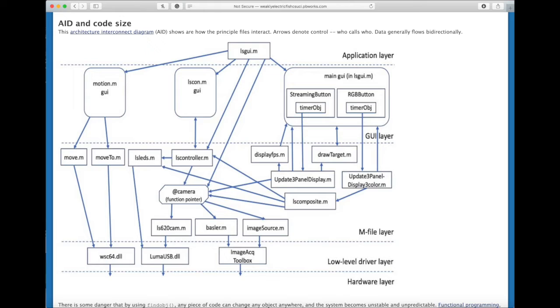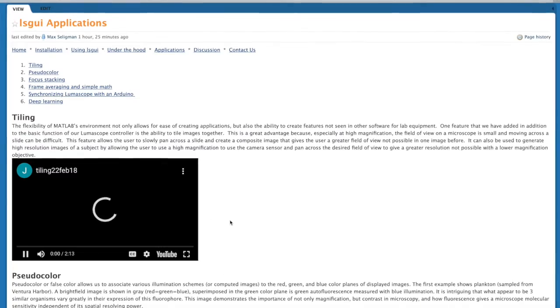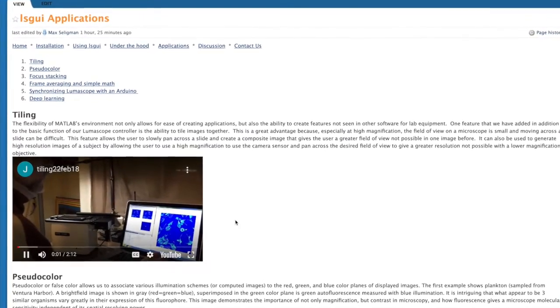Our program is also able to be compiled into a standalone executable via MATLAB Runtime. This allows users to choose to run our program from the MATLAB command line, or if a user does not have access to MATLAB or does not want to run through MATLAB, they can download the free compiler and use the standalone application. The applications of this project are endless. We have outlined a few key ones here.